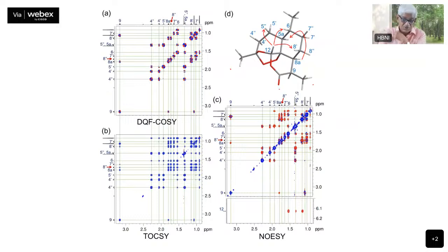And then what we have here is the double quantum. Their assignments are also indicated on the top. Individual assignments are already given there, but typically these assignments are obtained after this analysis. And of course these are phase sensitive spectra. You can see the double quantum filtered COSY, the blue and the red indicate the positive and the negative components. Okay, so these are high resolution, very well resolved spectra, and you can see the fine structures in the individual peaks as well.